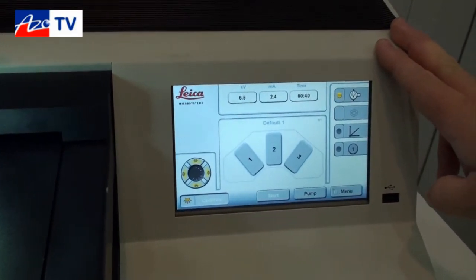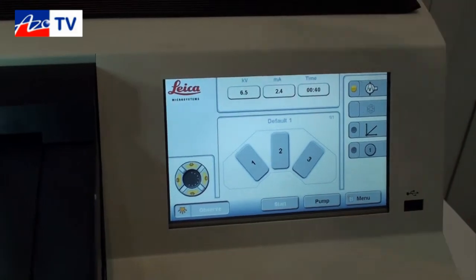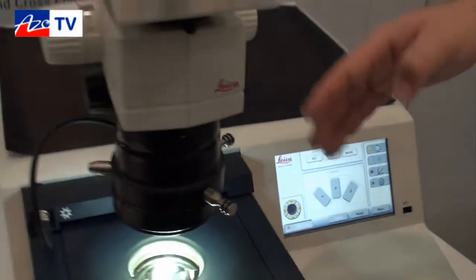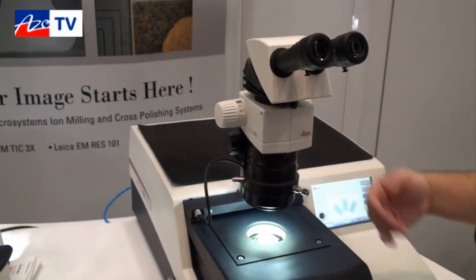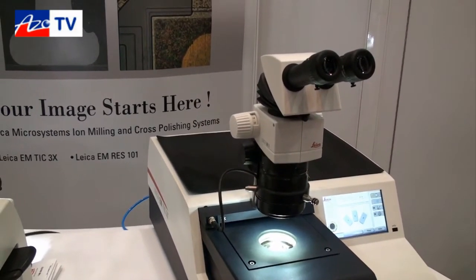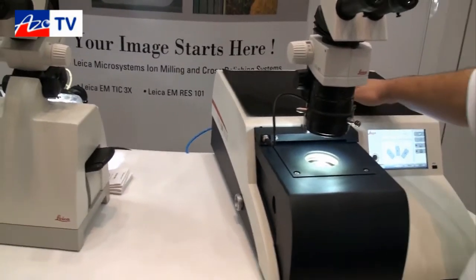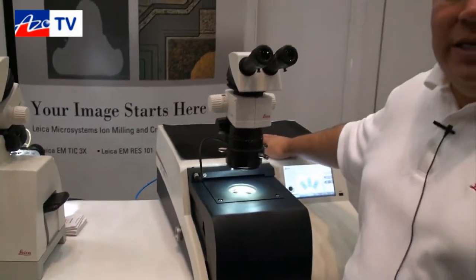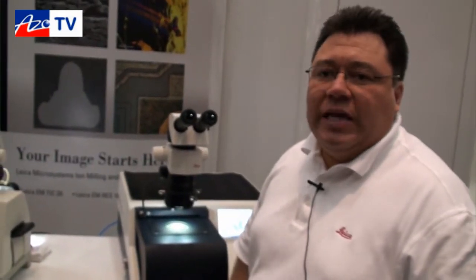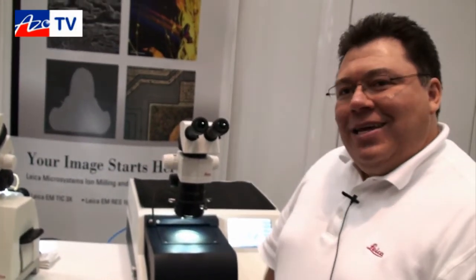You can also do a contrast enhancement on your sample at the end to give it a real nice polished finish. We have three different microscope setups going from average magnification all the way up to 225x magnification. We have a decoupled pump inside so that vibration is limited, so when you are looking at high magnification you won't see vibration on your sample. And that's an introduction — so what sort of applications do people use the TIC 3X for?